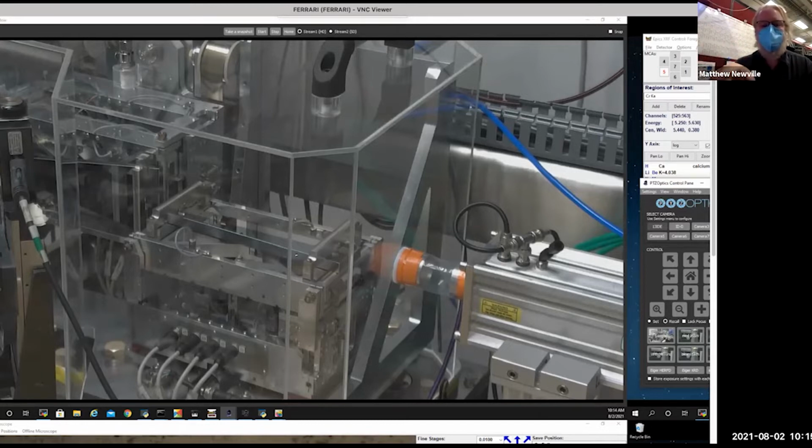We do that dynamically, but I also want to mention one other point, because you're going to ask the question, well, if you take that beam and you press down on both of those bars, you don't make an ellipse, you make a parabola. And I would say, you're right. And that's why the mirror, as you can almost tell in this mirror, but you can more easily see in the next mirror down, is a trapezoid, not a rectangle. That makes it a better approximation of an ellipse.